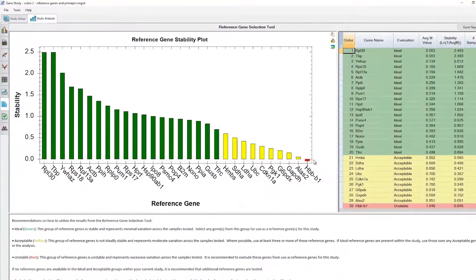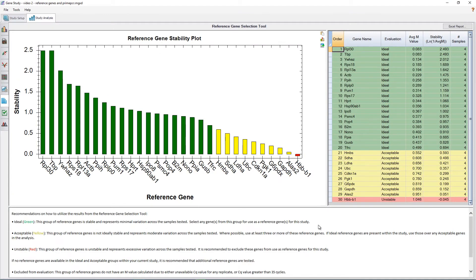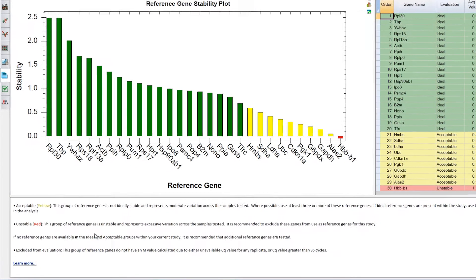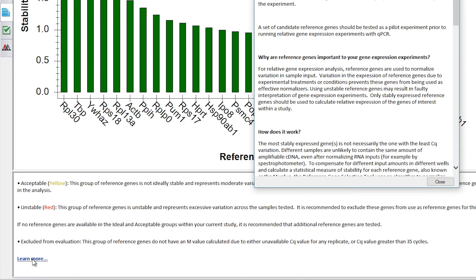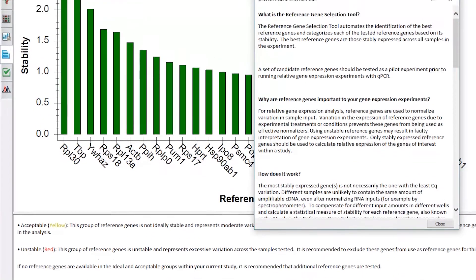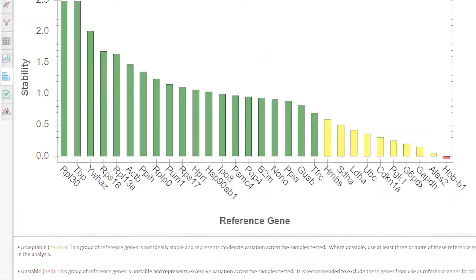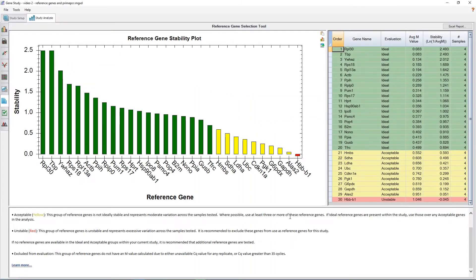These can be used for normalization, but it's recommended to use at least three in order to improve normalization accuracy. Finally, genes in red have poor stability and should not be used as reference genes. We can also see that in the text box below the chart, an explanation is given for each color category, and if we click on the Learn More link, we can view a pop-up box with more information on the Reference Gene Selection Tool. An important thing to note here is that genes need to be designated as potential reference genes in order for their stability to be shown in this tool.